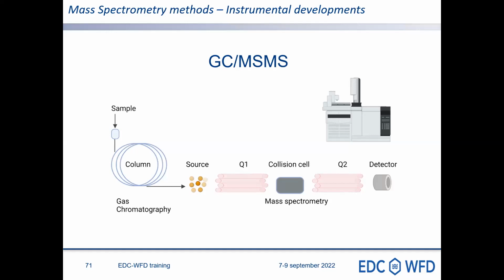Okay, thank you. So as already mentioned, an alternative to LC-MS, GC-MS can also be used for the analysis of estrogens in water samples. And thus we also developed and optimized the GC-MS for the determination of estrogens in a whole water sample, considering also different compatibilities of laboratories and also different purposes of measurements.